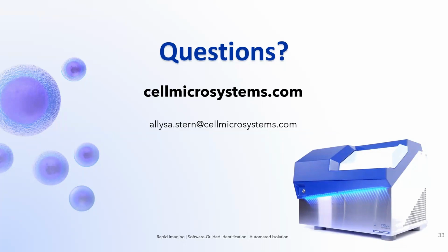That's a great question, and I think that's a little bit model dependent. Our adult stem cell derived organoids that have a hollow lumen and are more epithelial in nature, we've grown those on the array up to 1 millimeter in diameter before isolation, and we can still continue to grow those off of the array.